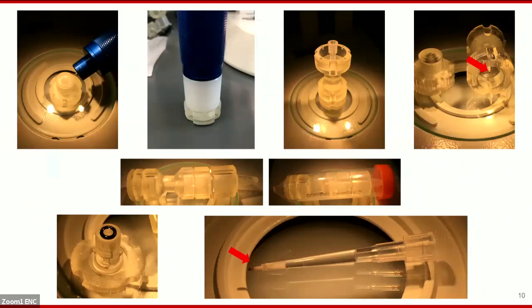We've gone through different iterations of the tool and used different 3D printing resins. And so these images show generally how our packing process works, even for our newest version, but it's just with an older version of this tool. You can see how it neatly interfaces with our Bruker tools. We have the blue grabber tool for the 0.7s, which then also aligns with the base, and we can then insert the rotor there.